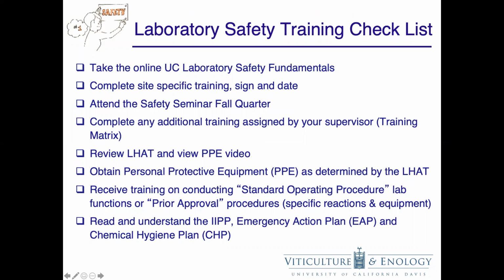Because working in the laboratory presents many various hazards, safety training must be completed prior to beginning any work in the lab. Personnel working in laboratories must complete the online UC Laboratory Safety Fundamentals, complete the site-specific training, and complete any additional training as required by the lab which you'll be working in. This additional training will be discussed later on.